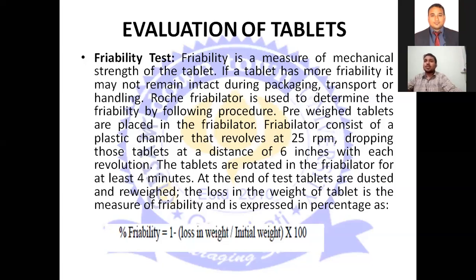Next is the friability test. For the friability test, we use a rotary friabiliter. We take 10 tablets, first weigh all the tablets and note the weight. After that, we put the tablets in the rotary friabiliter at 25 rpm for five minutes. After five minutes, we take the tablets out and again weigh them, noting the final weight.